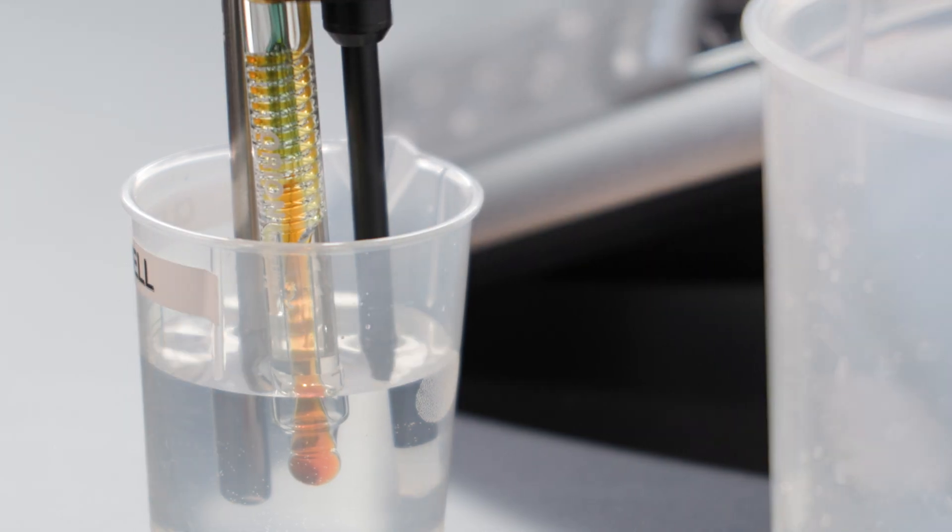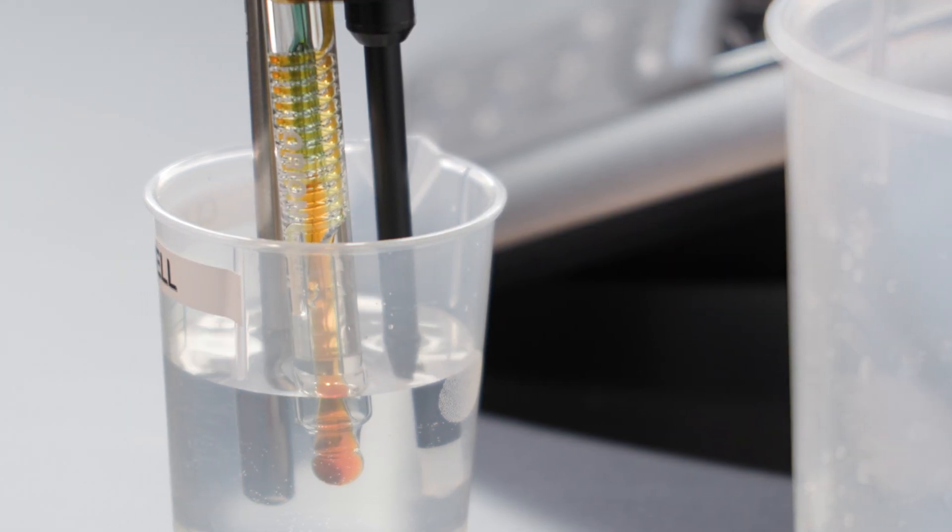Once you've determined what meets your needs, you should consider the dimensions of your electrode and container. While many people measure pH in standard beakers, sometimes the sample container is too large, small, or narrow for the electrode, or there isn't enough of the sample itself. That's why it's important to know the dimensions of your container before selecting an electrode.